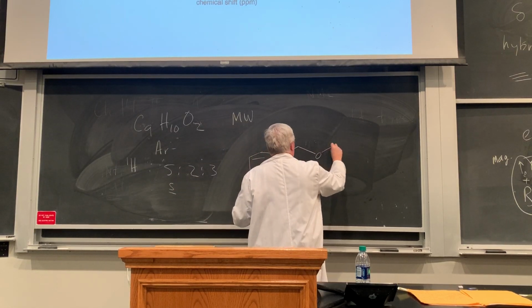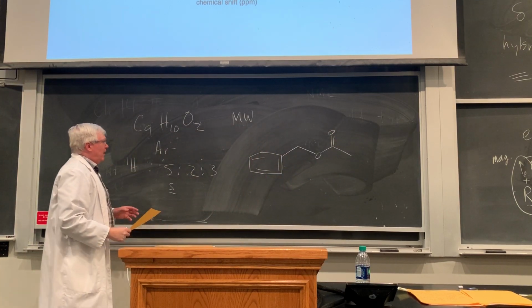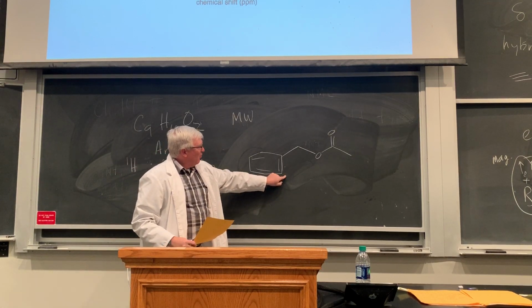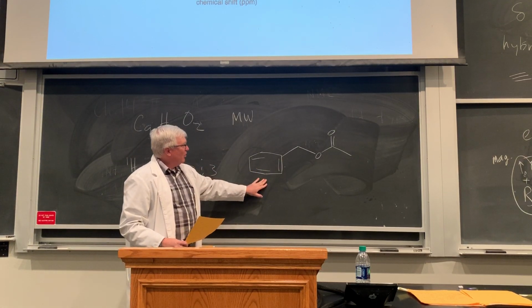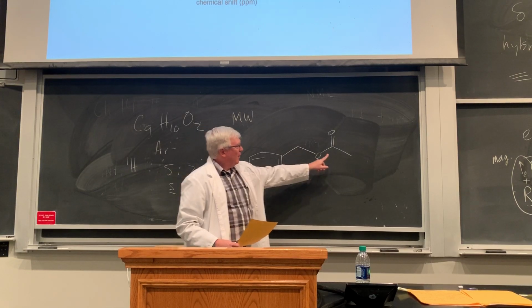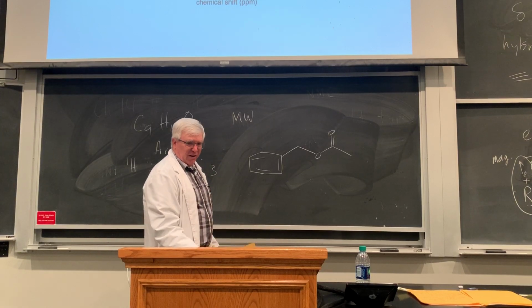It's actually this acetate ester right here, okay? In the 3 sets, like I said, a lot of times these 5 aromatic ones on a monosubstituted benzene will all show up the same. And then this is also a singlet. It's different than the methyl here. And that's the 5 to 2 to 3 that you can figure out there.